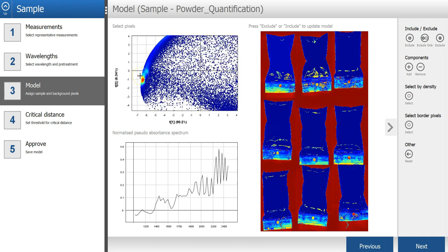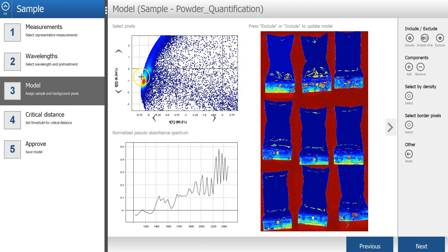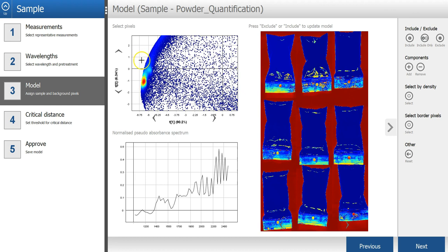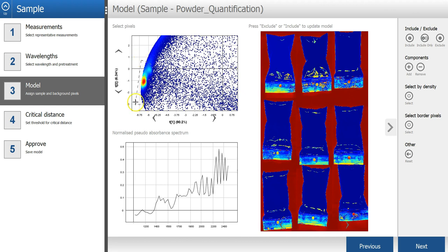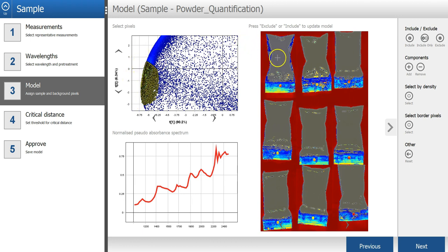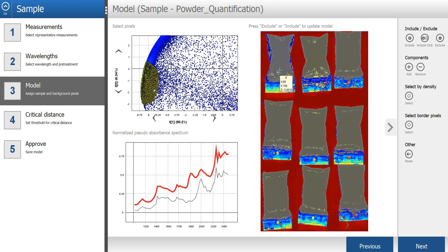If I select all the pixels in one of the clusters, I can see that these pixels correspond to the sample pixels. And then press include only.